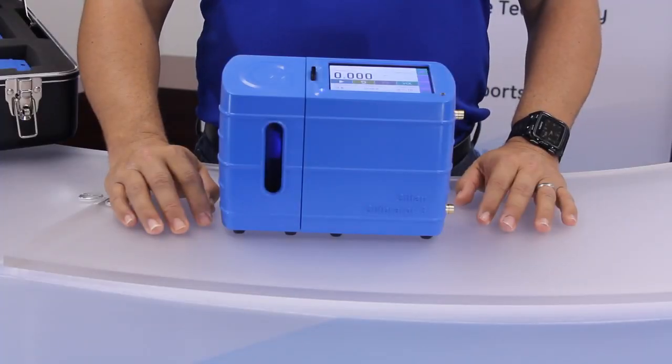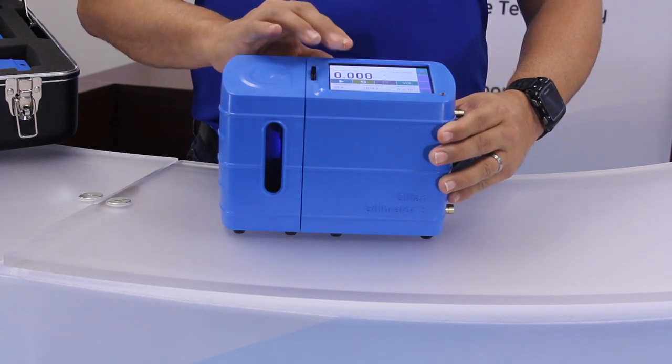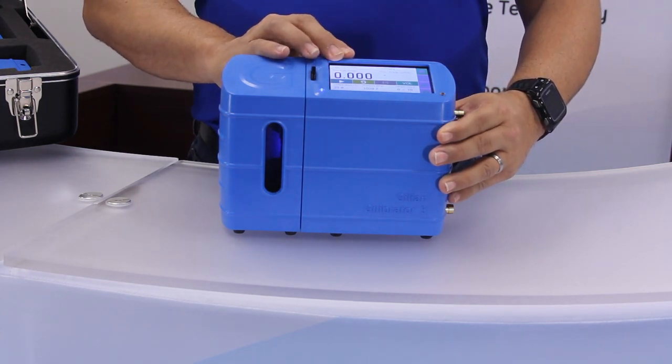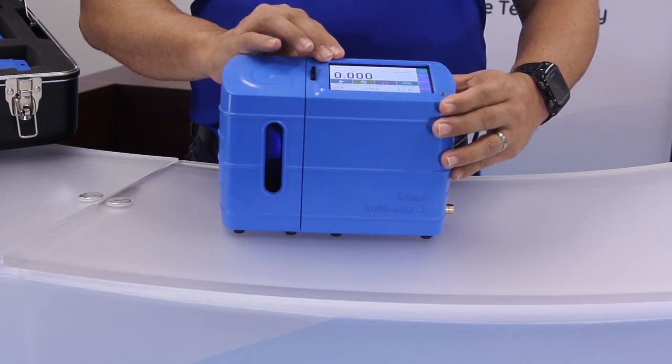Now I will point out the key functional parts of the Gilibrator 3. The LCD display is a color touch screen that allows the user to interface with the calibrator. You may also use a soft tip stylus if preferred.